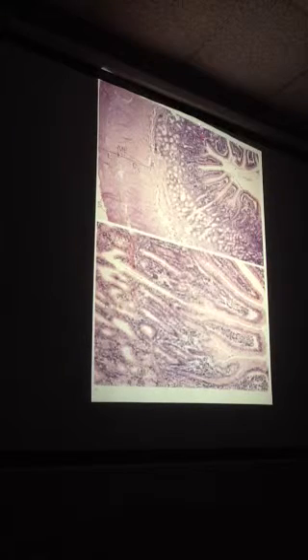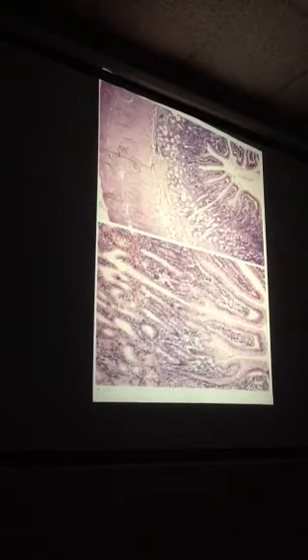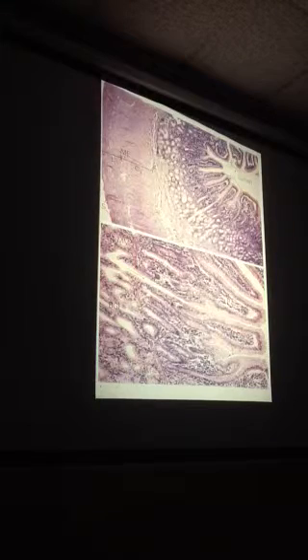You then go to the base of the fingers where there are these little pockets. See it better over here, more magnified. These are the intestinal glands or crypts, little caves. And then if you go deeper into the submucosa, right here, you have these glandular pockets, mucus cell clusters, Brunner's glands.